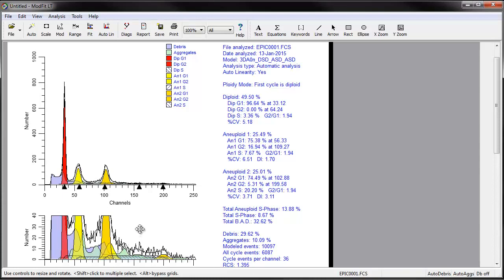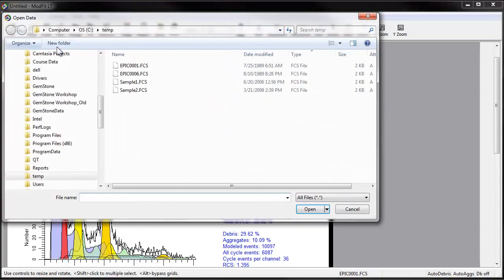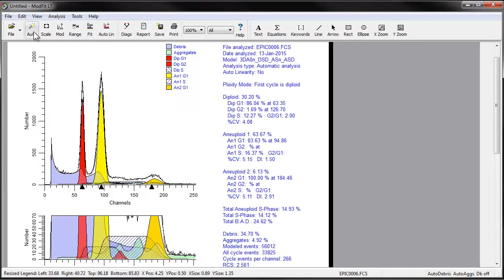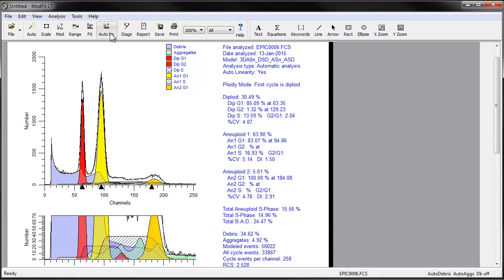Let's look at a file for which a linearity value of 2.00 is too low. After auto-analysis, this aneuploid 1 S-phase is shown as 16.37% and the RCS is 2.561. After doing autolinearity, the optimal linearity factor is shown to be 2.04. The aneuploid 1 S-phase is now 16.93% and the RCS is lower at 2.528.